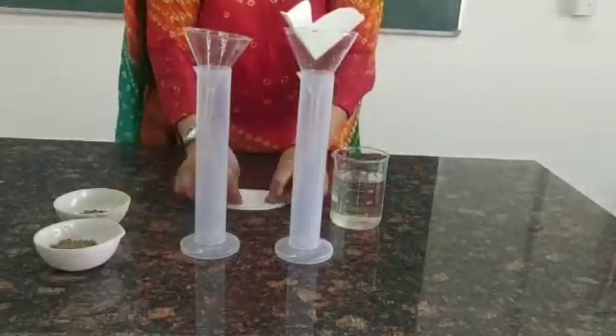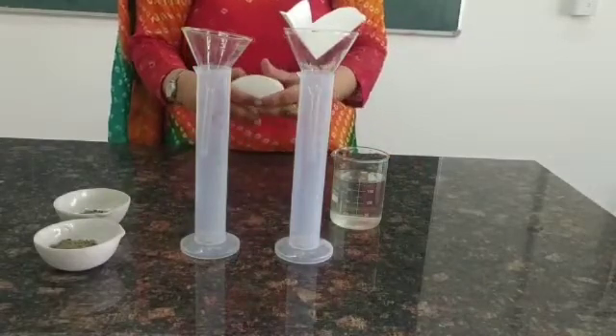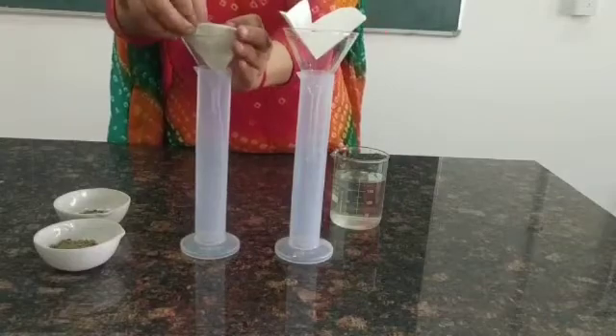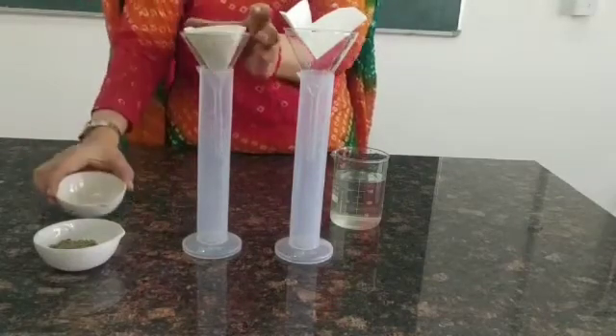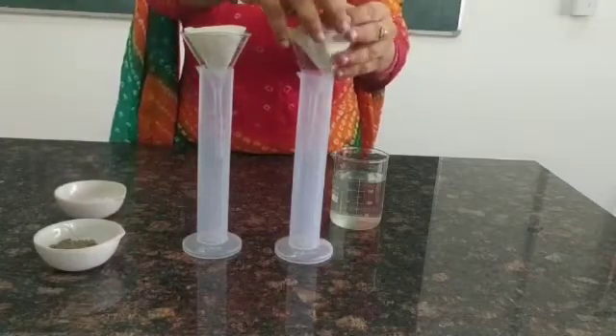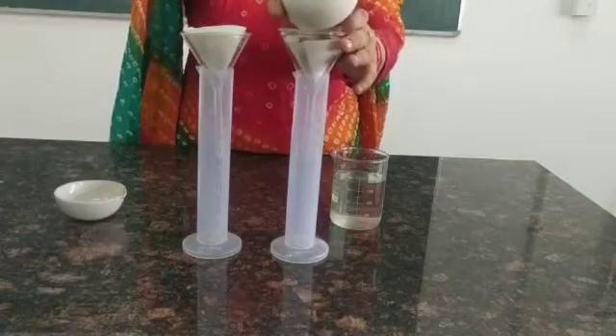Then we are going to transfer the soil samples into each funnel. The first is the soil sample taken from the garden side, and the second is the roadside soil, which is transferred into the second funnel.